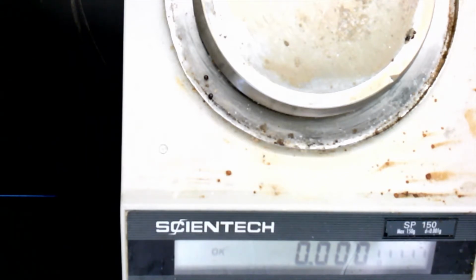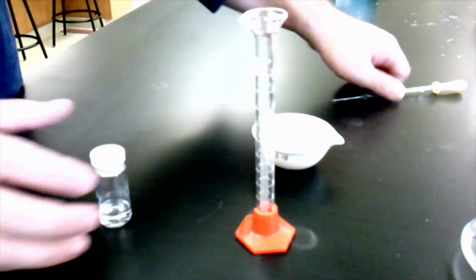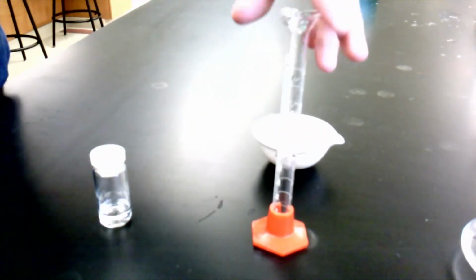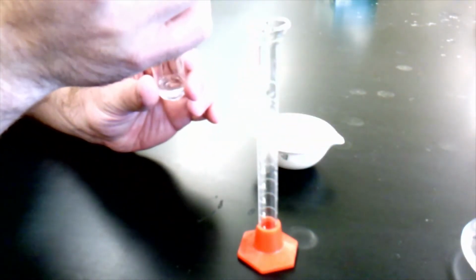All right, we will be right back with the reaction. The next step is to measure 3 milliliters of HCl using my graduated cylinder. So I have my HCl here in a little vial. Get this cylinder to where it's a little more level, and I'm ready to measure this.